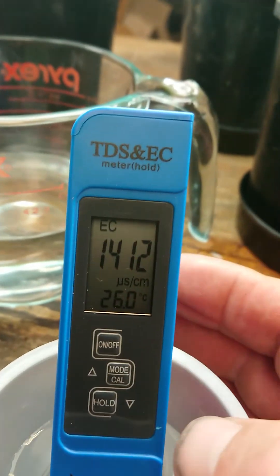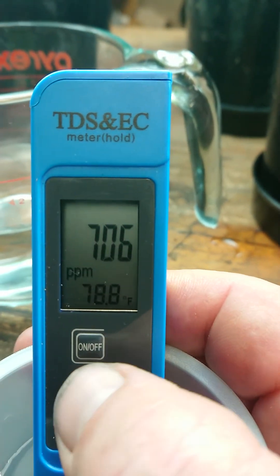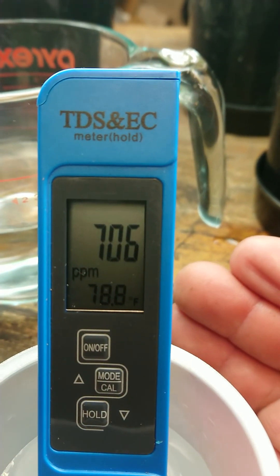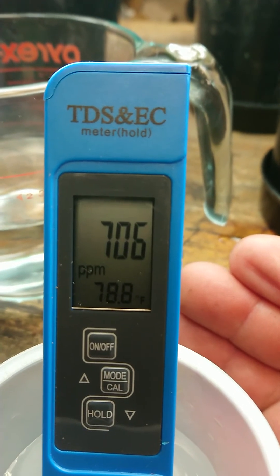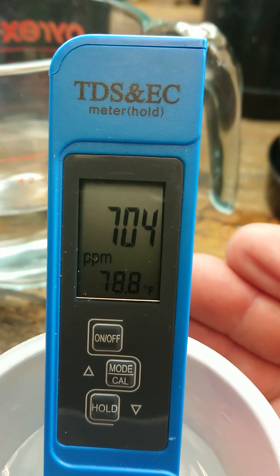And there it is. Now you simply leave the unit alone, it stops flashing and it is now calibrated. It reads 1412. If I now press the mode button I should get a reading of 706 parts per million — and there it is. It is as easy as that. Vivosun TDS and EC meter calibration mystery solved.